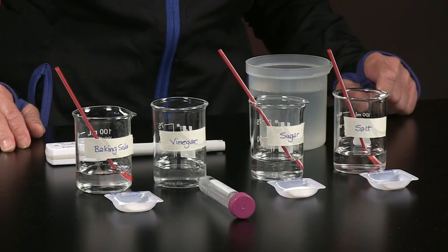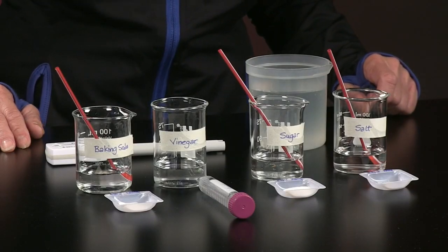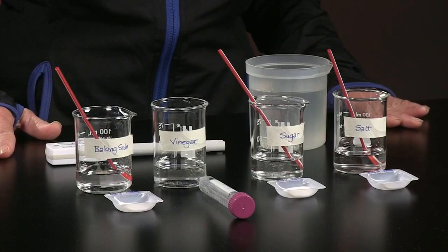To set up this lab, I want you to pay close attention to the quantities that are already written in your lab protocol. We have pre-measured sodium chloride, 0.23 grams of it, the sugar, 1.43 grams, and the sodium bicarbonate is 0.35 grams. Those numbers are going to be very significant when you get to the analysis part of this lab. Vinegar, we have measured out 5 milliliters of vinegar. Commercial vinegar is a 5% solution. Again, that value is going to be significant when you do the analysis for this lab.